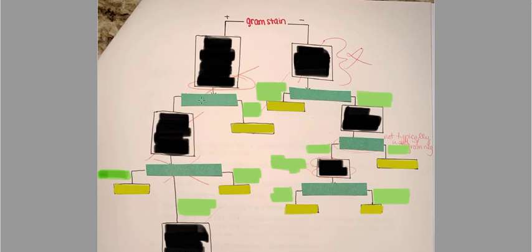Now, the test is written here in this darker green region. And then whatever this test was, if it ended up one way, so let's say positive for whatever it is, would then give this list of organisms. Now, the negative, if that's what it is, would then give this organism. And all of the yellow highlights here are end organisms.